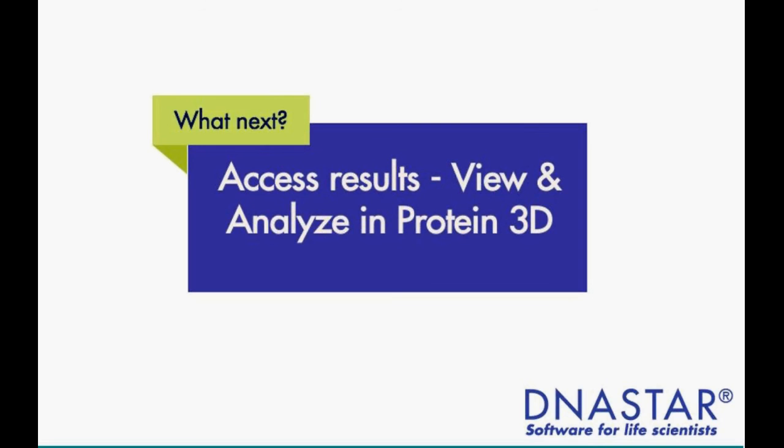So I want to take a look at our viewing application in the LaserGene Structural Biology suite. It's called Protean 3D, which was developed to analyze protein structural models and apply various analysis methods to those sequences and to those structures.